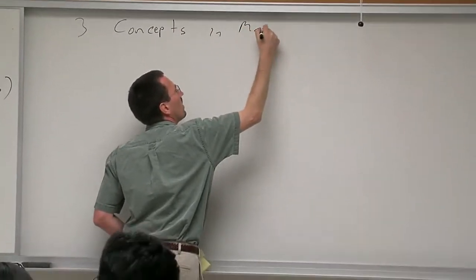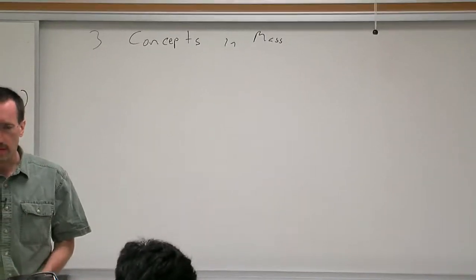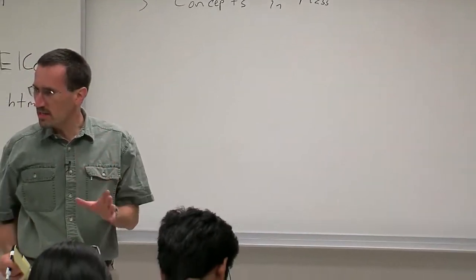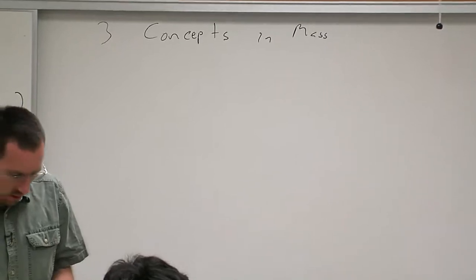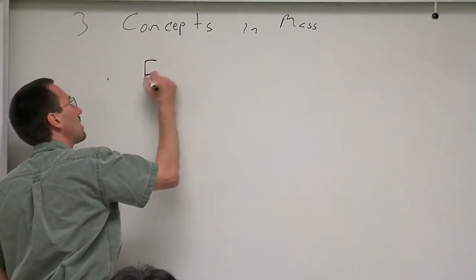in mass spec really aren't very hard. And in fact, nothing is hard about mass spec except we think differently than we've gotten used to thinking as organic chemists. So the first concept is exact mass.